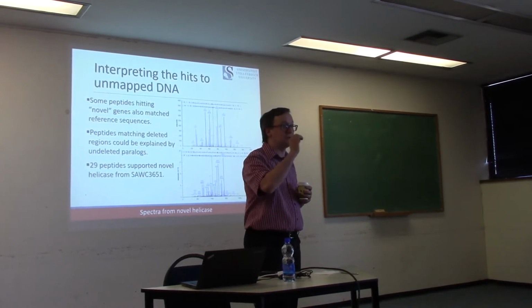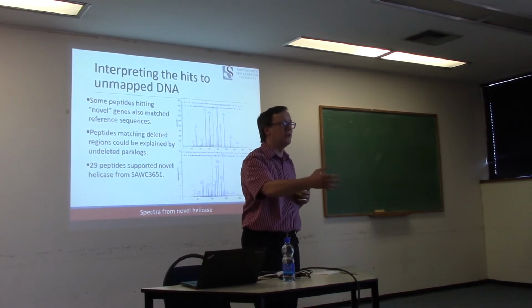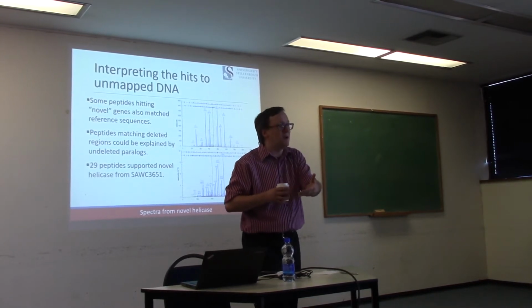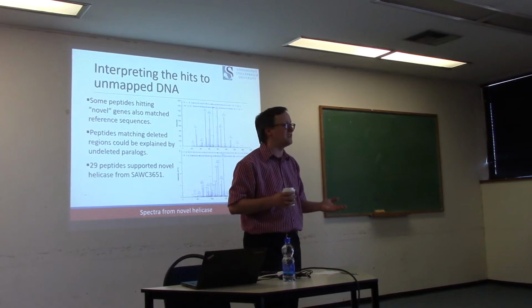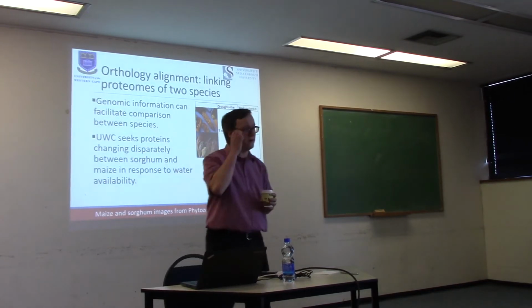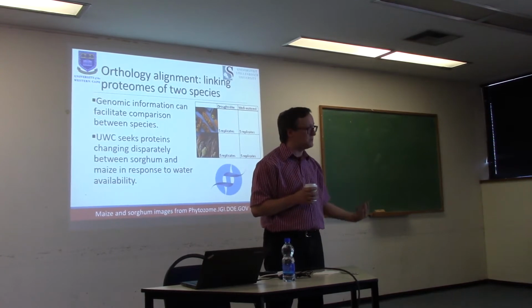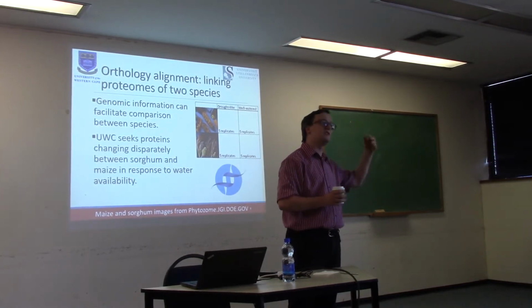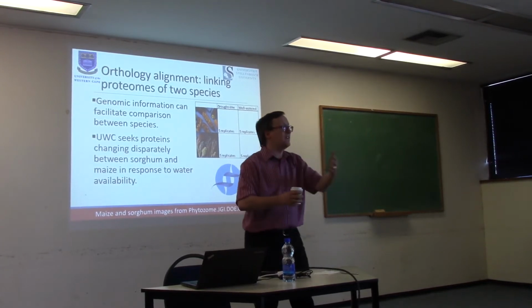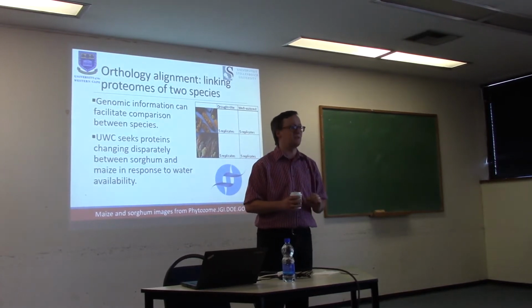So we can see that these strain variants don't just change around the sequences slightly of the genes that they're carrying. They may occasionally perhaps have horizontal gene transfer. They can gain protein sequences that we don't associate with H37Rv at all. So that was kind of a surprise for us. All right. So that's kind of a classical exploration of the kinds of things one expects to do with proteogenomics: to find genomic variation, confirm it to be gene expressed, and to have the evidence on a sequence level that shows that this particular sequence is available.